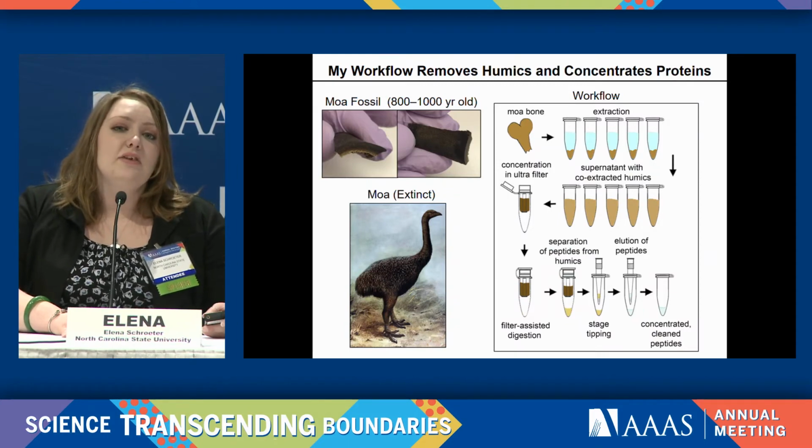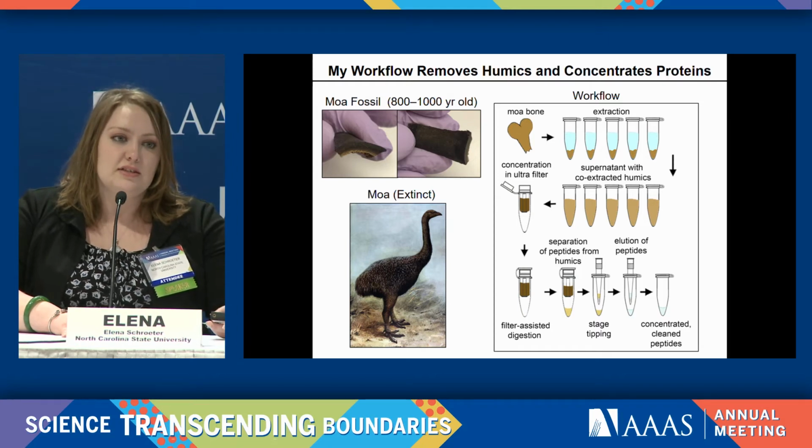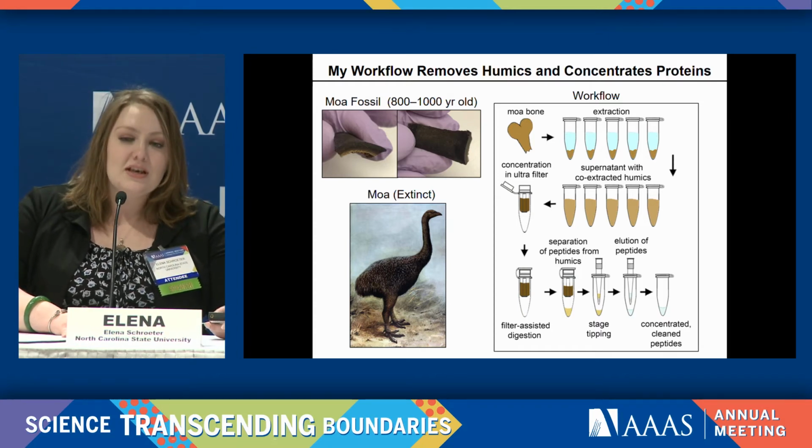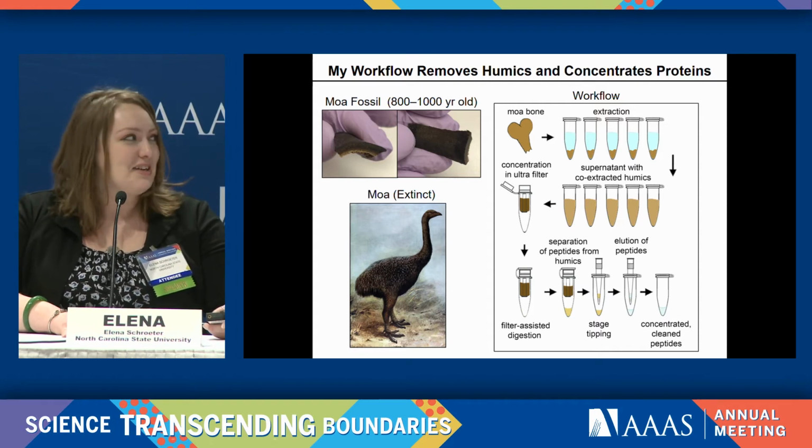So what I did is I developed a workflow that is basically geared toward removing large amounts of humic substances from some of the more problematic samples. Some fossils you get don't have a lot of humic substances, and some have a lot of humic substances.